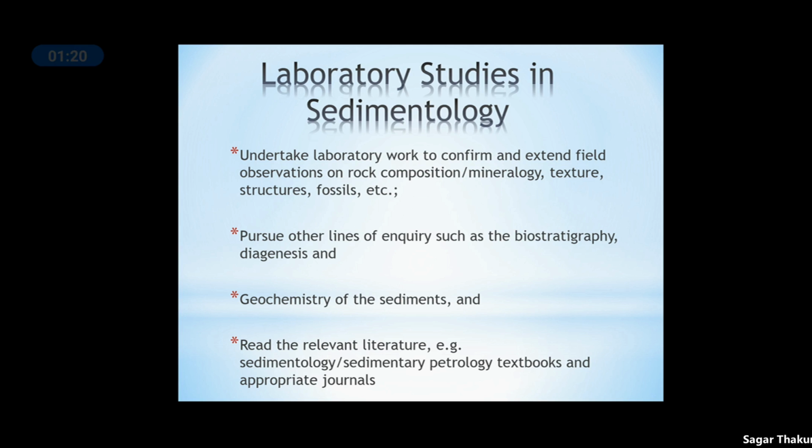Now, the use of laboratory techniques depends upon the expected results. So when you go in the field, you have a certain idea in your mind what kind of work you're going to do. Based on that, you collect the samples and then you go for the laboratory analysis depending on the results which are expected. So although there are numerous available techniques, you have to limit your area of research and study based on the expected results and conclusions.